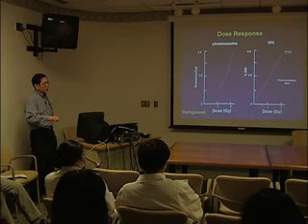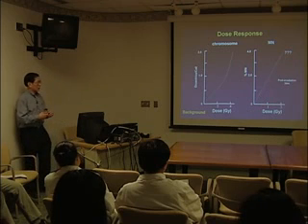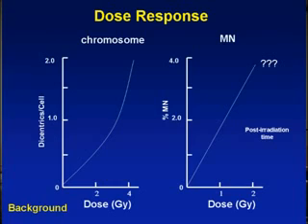For example, whether it's linear, or with a curve. Actually, at this moment, I think some of the study from Dr. Yuqiao Chen's lab showed that depending on which population of cells you look at, if you look at the lymphocytes, it'll give you this type of response. But if you look at the red blood cells, it seems to give you a linear response, and they still don't know exactly why there's such a discrepancy between the two.